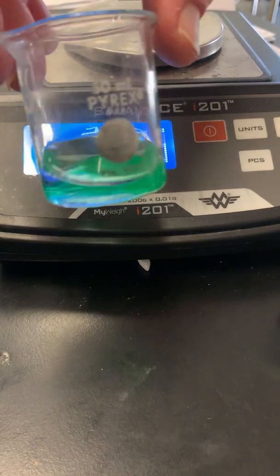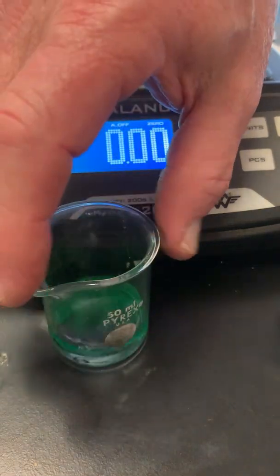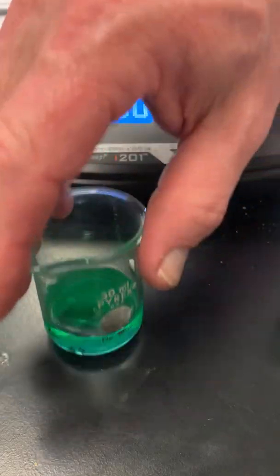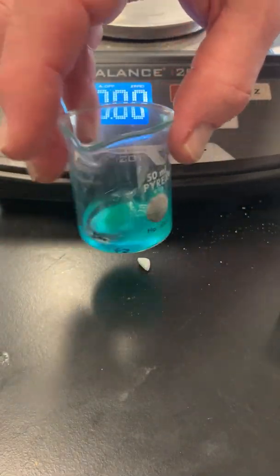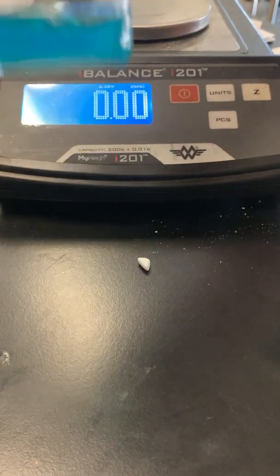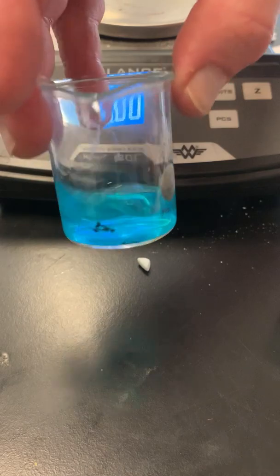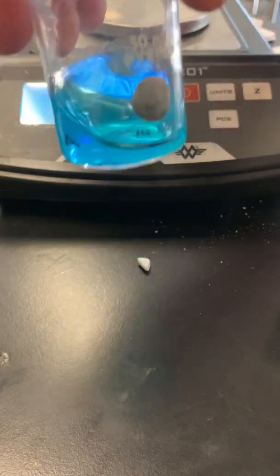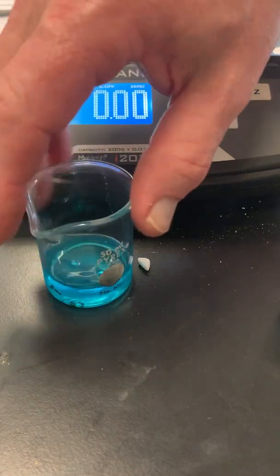And I think you're supposed to have an observation. So you can see it's going blue. Blue is a typical color for copper to be in solution. And so it's also green. The more you put into it, the greener it will get. And there we go. We have a solution of copper chloride.